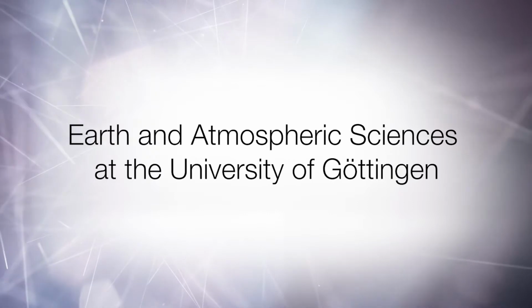I started here in 2007 and our research focus is on high precision measurements of oxygen isotope ratios in rocks, minerals and water samples. One application is to measure the isotope ratios in extraterrestrial samples, in meteorites coming from far beyond within the solar system and from the moon or from Mars. And with the oxygen isotopes we can identify these materials and their source bodies.